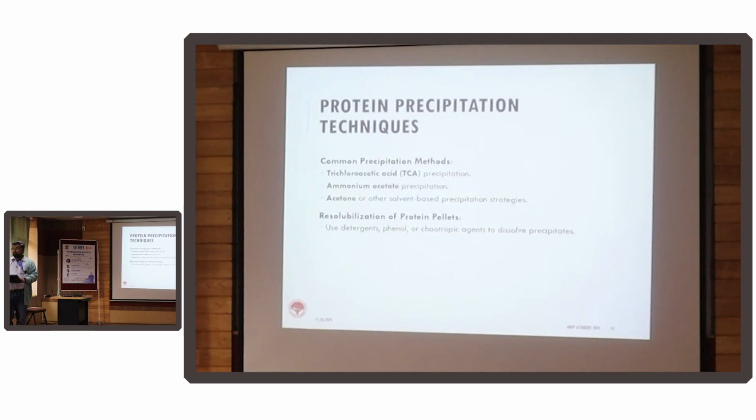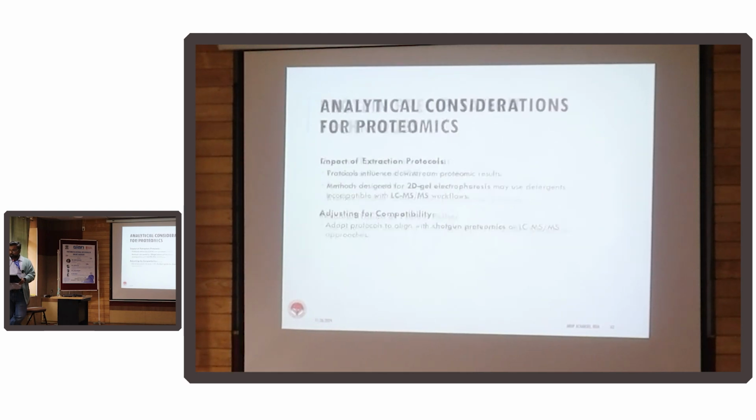And of course, since you are using two different technologies to extract, especially for stuff like fruits or maybe for leaves. So you want to understand why a leaf gets brown during the spring, so you want to understand the proteome profile of that. If you are not using the same methods of protein extraction, you are adding one more variable. That becomes a limitation of your experiment, right? But that's fine, rather than not doing the experiment at all.